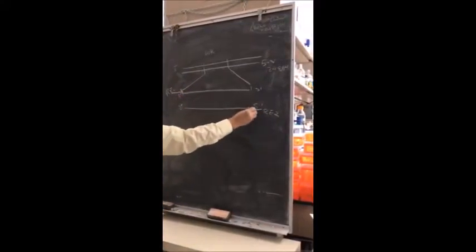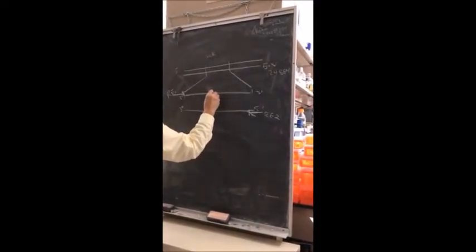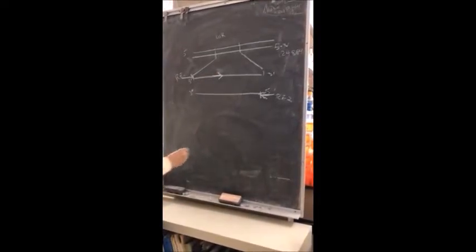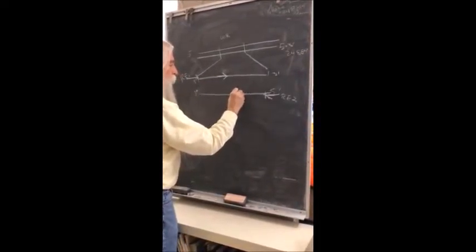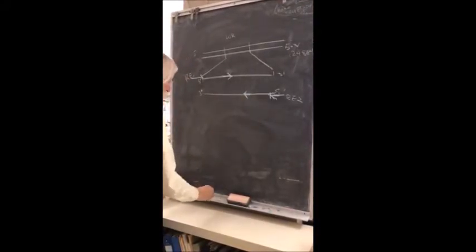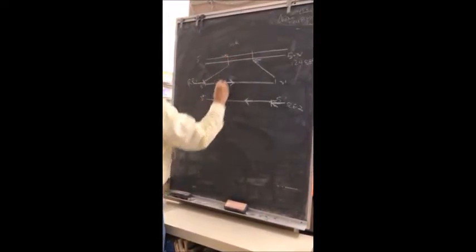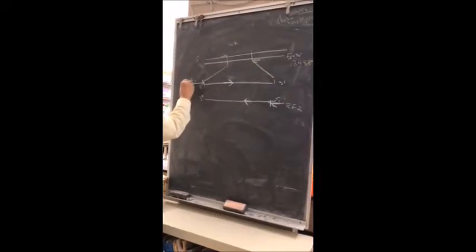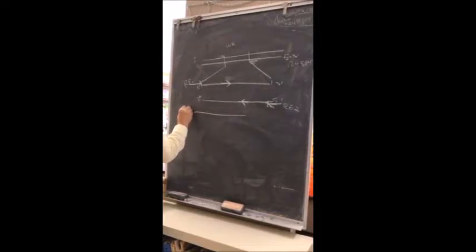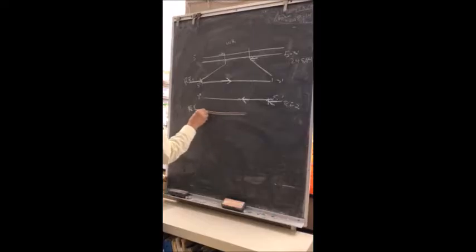And we generated 2 other primers inside of this WR region, one located approximately halfway in, and the other one also located approximately halfway in. All right, so you can see now that instead of amplifying the whole thing in one step, we're amplifying it in 2 steps. The first step amplifies from here to generate this fragment that has a restriction enzyme site on the 5' end, and it's double-stranded.